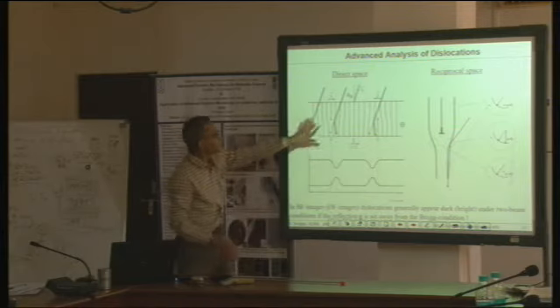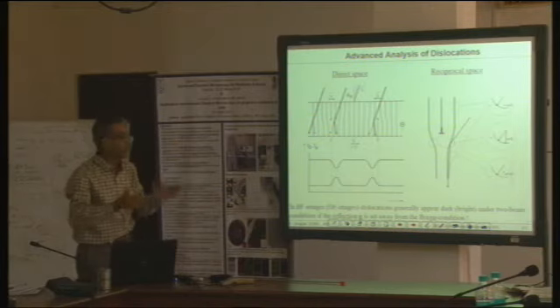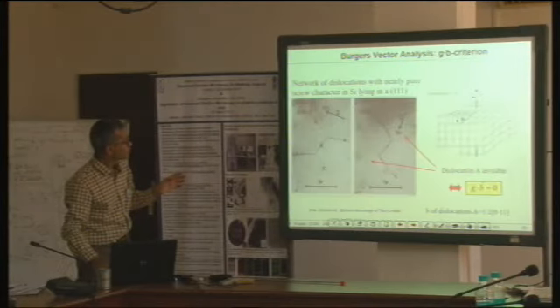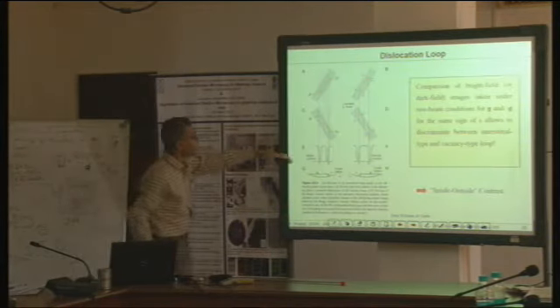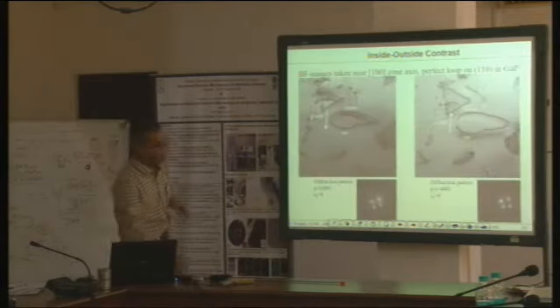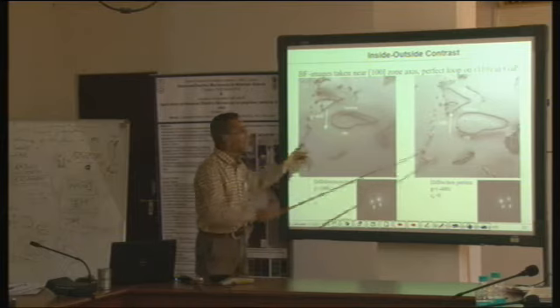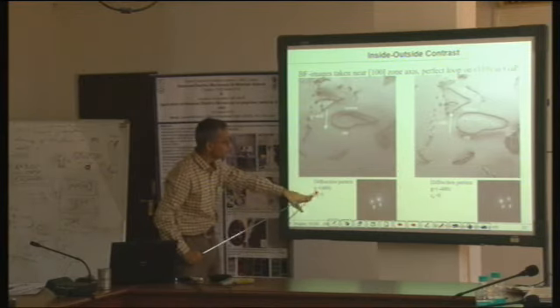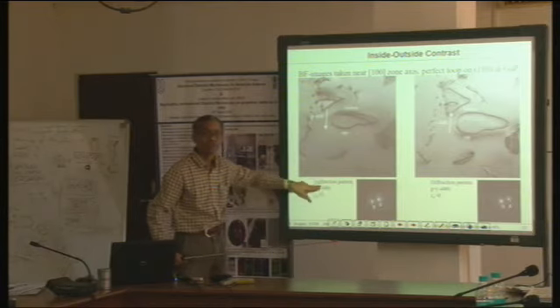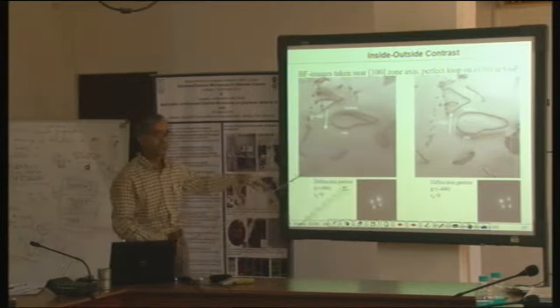So the same dislocation structure, depending upon whether your S was greater than 0 or less than 0, will look smaller or bigger. I think an example is displayed here. This is the same thing, but here it looks smaller and here it looks bigger. That was the effect of S being greater than 0. Here S is greater than 0, but the G was 400; the reflection used was different here. So you can do it either with the reflection or with S.